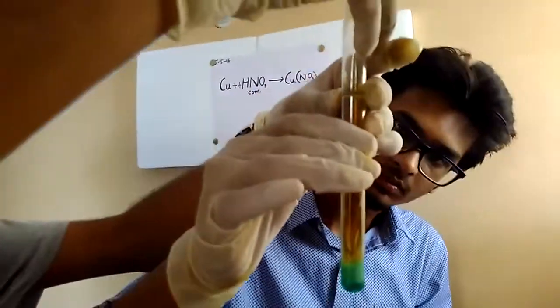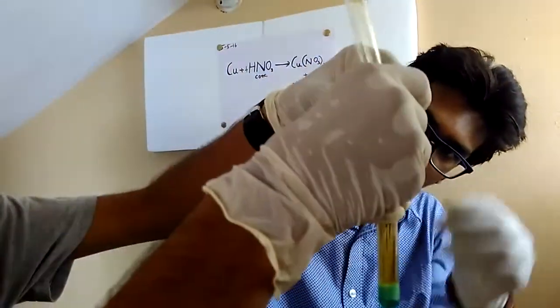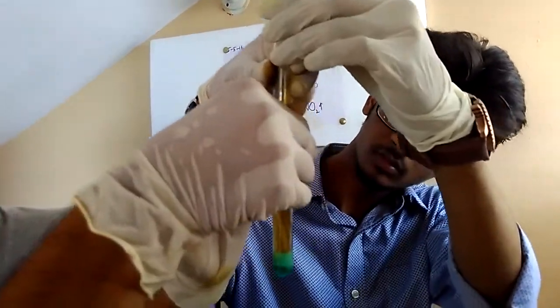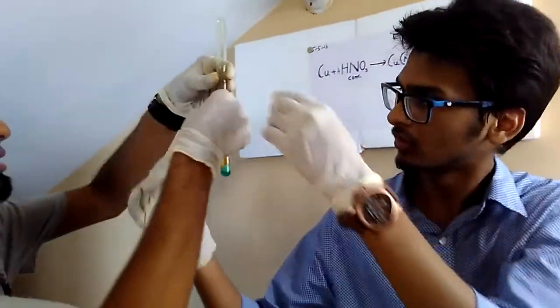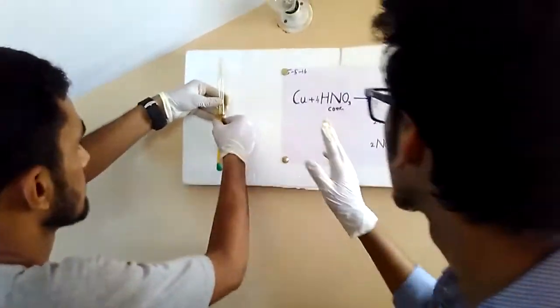I will take it in the test tube so that we can observe it carefully. Are you going to show the reaction out there? Yeah. So here is the reaction.